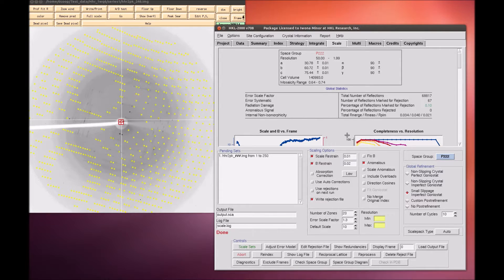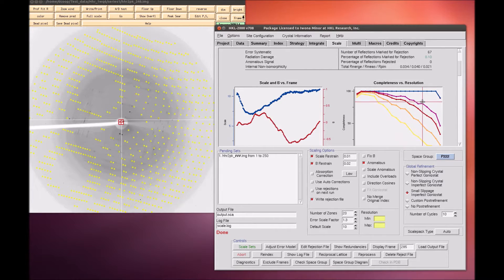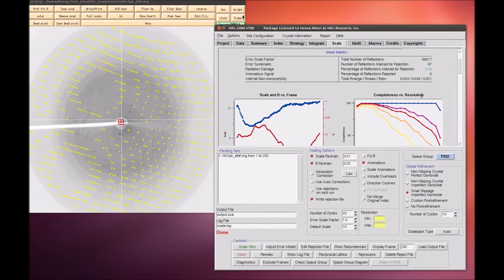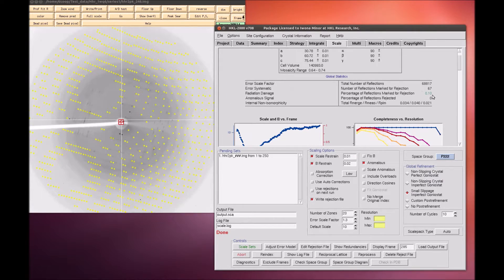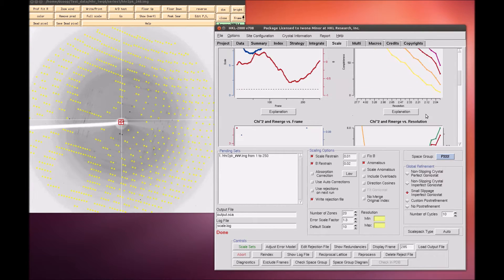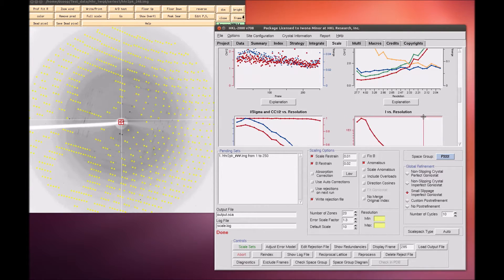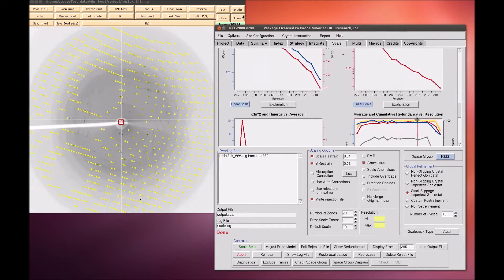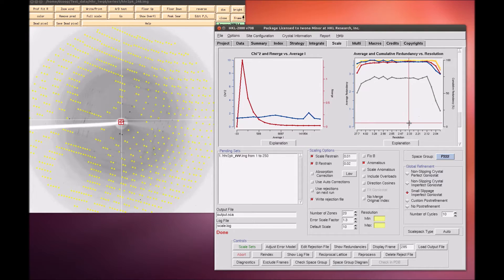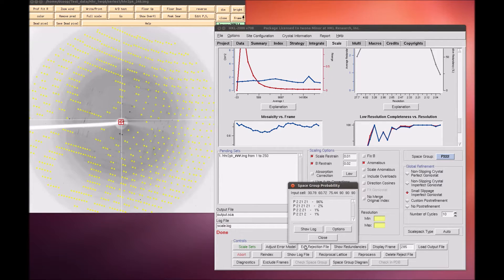When it says Done, you can get an idea of the quality of the data by looking at the global statistics at the top, as well as the various graphs that are presented. The final values will change, however, once we have the correct space group, so click on this Check Space Group button.